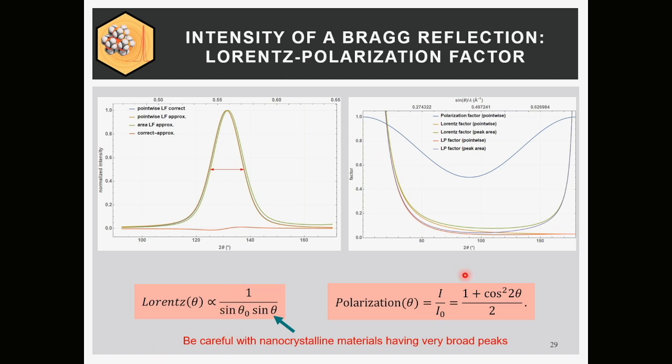And the polarization is also important. You have to know if you're using a primary beam monochromator, a secondary beam monochromator, or no monochromator at all. Big problem if you use Goebel mirrors. Not everybody knows exactly what the correct polarization correction for these is. In general there are values given by the manufacturer, or you can calculate them yourself, but you have to make sure you put in the right number. There are lists and tables of this. Just don't forget this.